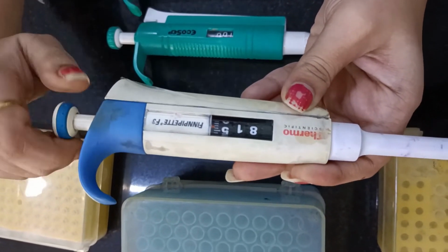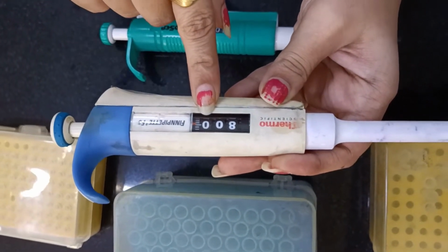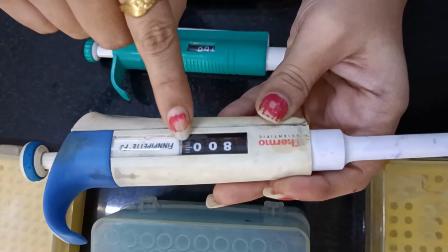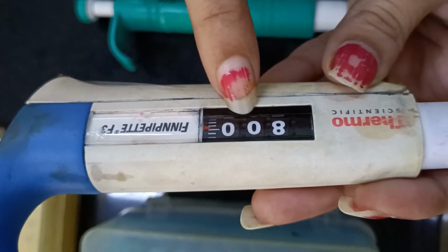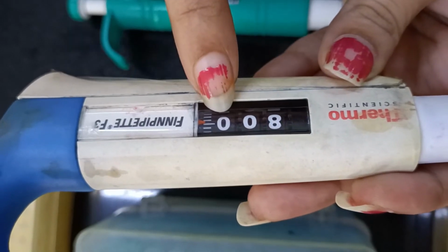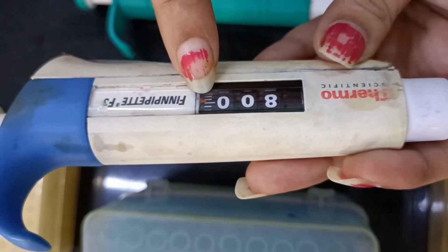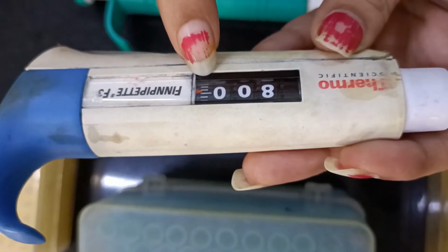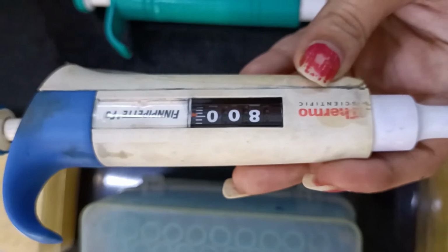I'm turning this knob. Now it is set to 800 microliter. Can you see a red mark, a red pointer over here, which is pointing to 800 microliter? If the red pointer is moving up or down from this 800, then it will be 800 point something over here.